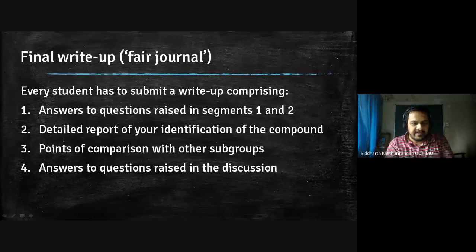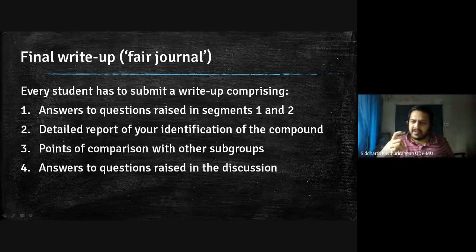So your write-up will consist of the following things. One is whatever questions were there in segment 1 and 2, IR और NMR के बारे में, उसका सबका explanation, half one paragraph roughly. If you want to write more, most welcome, but at least one paragraph to describe the answers to those questions. And then a detailed report of your identification of the compound, which is given to your subgroup.